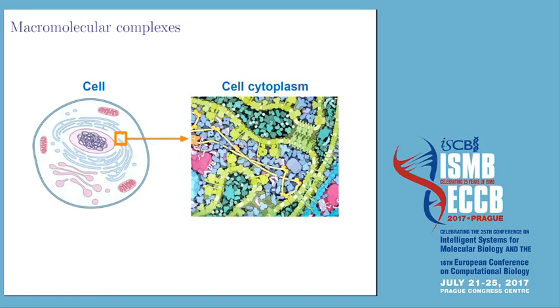To fully understand such cellular processes, we need to know systematically the native structures and spatial organizations of all macromolecular complexes inside single cells. This information has been extremely difficult to obtain, primarily due to the lack of suitable data acquisition techniques.